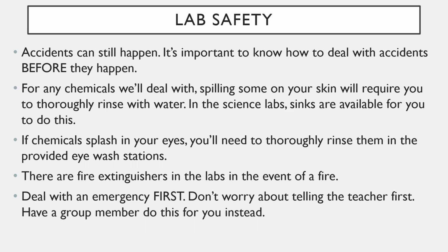You just put your face right up against both little nozzles, and then there's this button you push down. Again, hopefully nobody ever has to use that. I've never had to use one, to tell you the honest truth, but they are there if you need them. They'll rinse the absolute junk out of your eye. Now, there are also fire extinguishers in the lab in the event of a fire. It's pretty rare that we'll ever have to deal with that, but again, they're there if you need them.